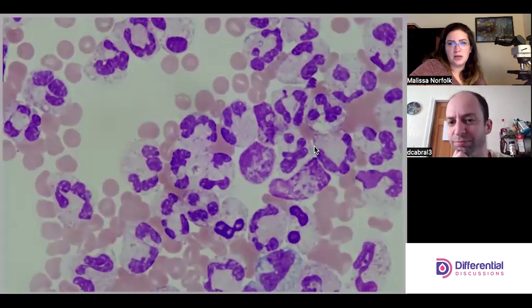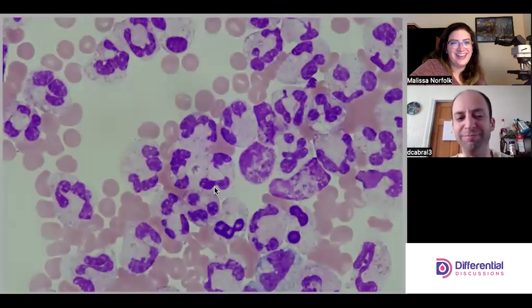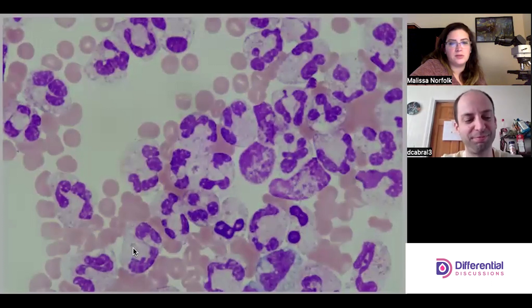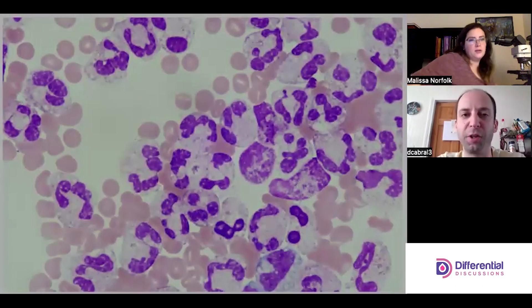Pseudogout crystals are typically nice rectangular shapes — the long ones are easy to pick out. This smaller one is still a teeny rectangular and refractile, like our typical pseudogouts. Shape can be really useful. Usually we use polarizing light microscopy to make the determination.